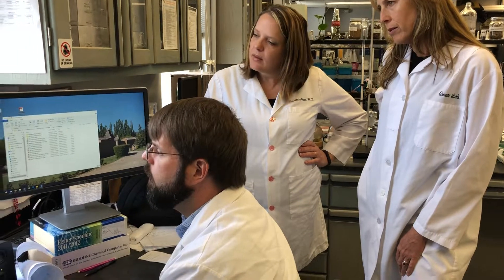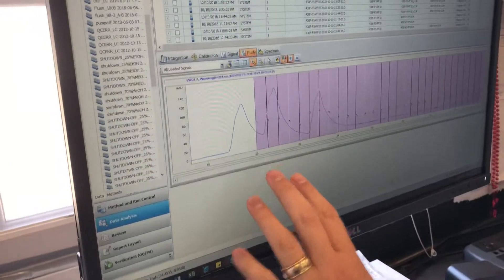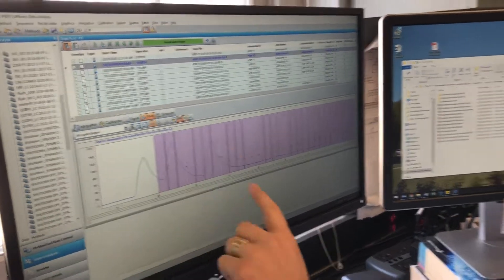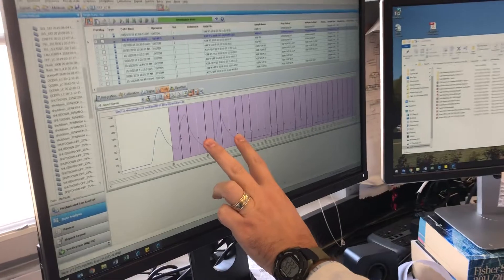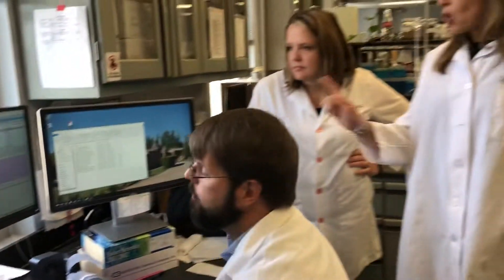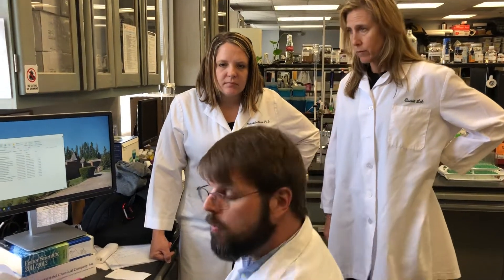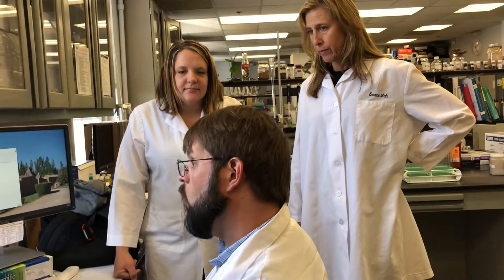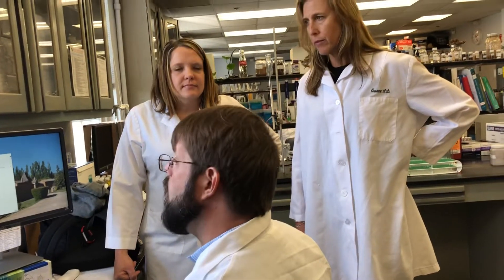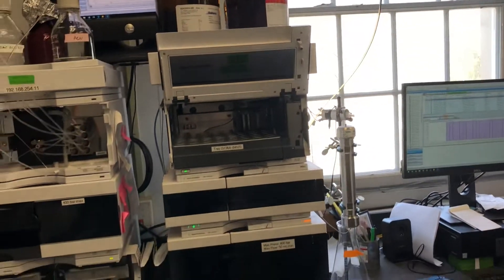We can see which tubes everything is going into. This compound we collected manually, but this compound came out in three or four tubes that we can then pour together and dry down. Those three or four tubes are distinct from these four tubes in which a third compound eluted. So we're able to separate three compounds from a mixture. This is a plant extract that was partitioned through hexane, ethyl acetate, butanol, and water — this is the butanol partition.